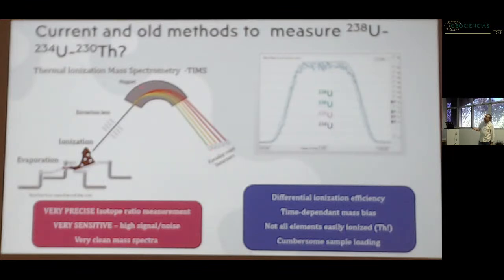Usually the lighter ions have less momentum, so they are easier to deflect, to change directions, while heavy ions have more momentum and are therefore more difficult to deflect, and therefore you can separate heavy from light ions.